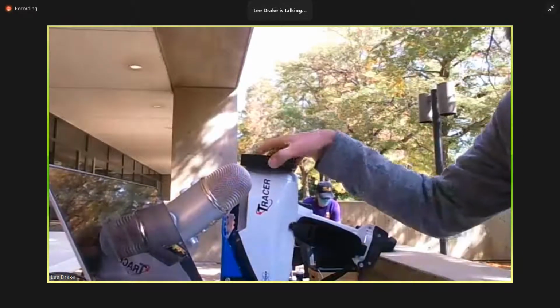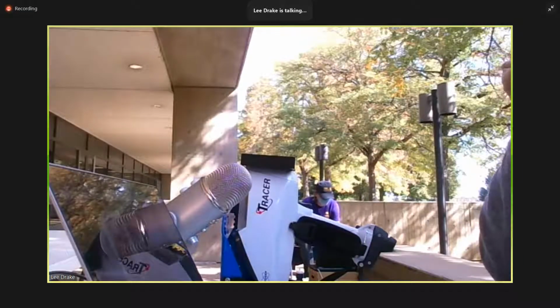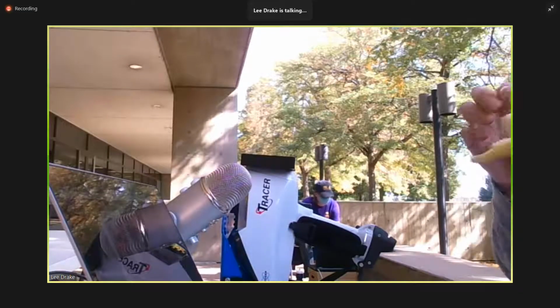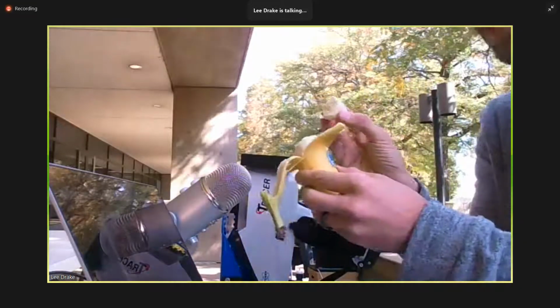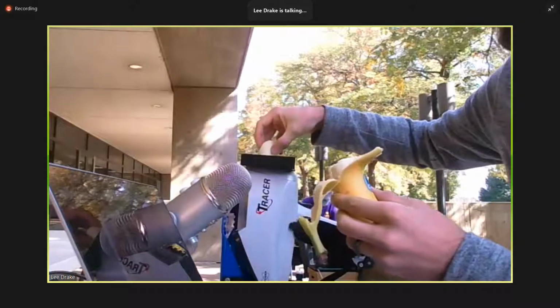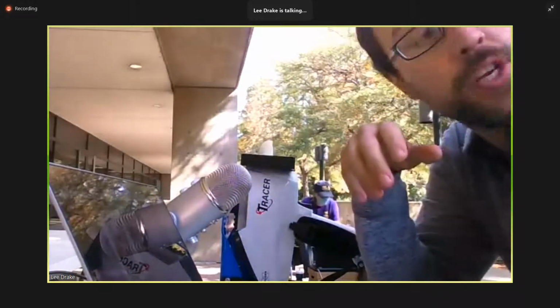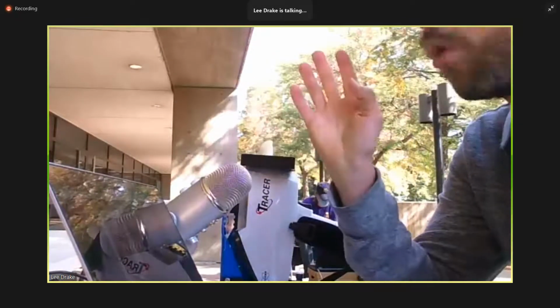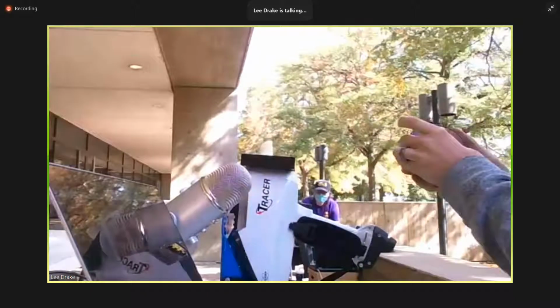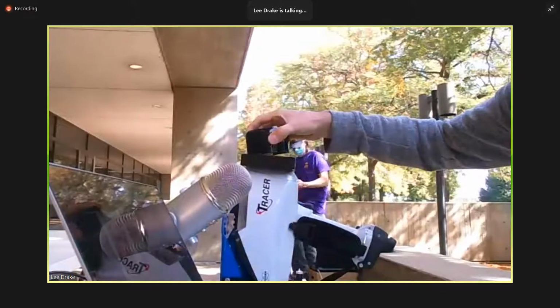Now, when I'm measuring the object, just so you know, I won't be able to be this close. But what I'm going to do here is we're going to analyze the banana fruit that is presumably high in potassium. So we're going to put this here. Now, because we're measuring an object that has very low density, right? Most of the atoms in here are going to be carbon or oxygen or hydrogen. What we're going to want to do is use a sample cover cap. That way the X-rays are contained.